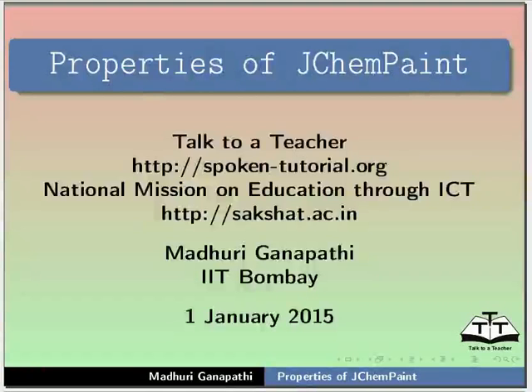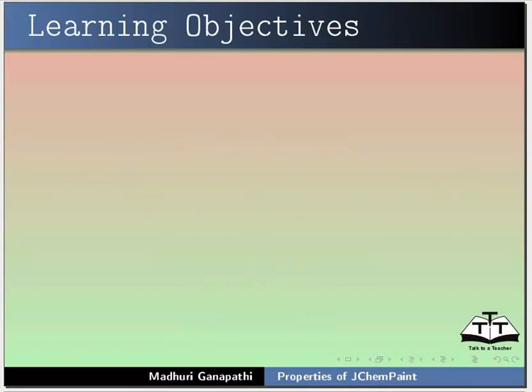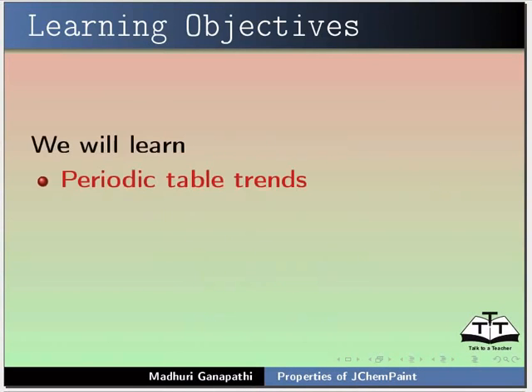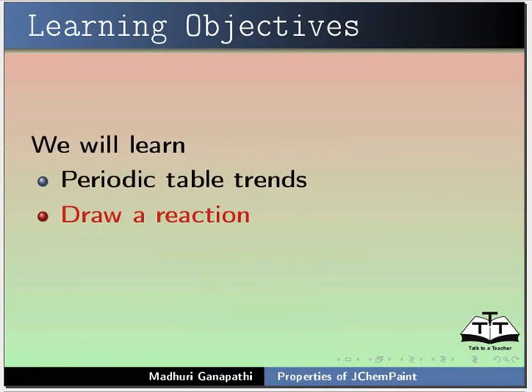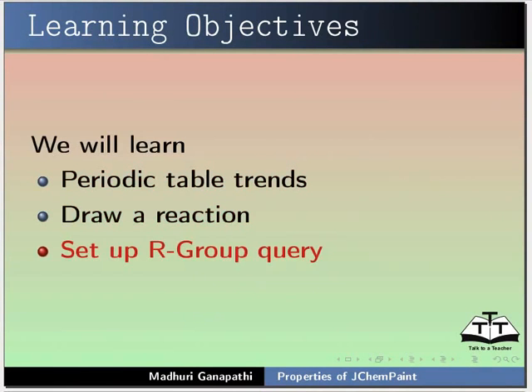Hello everyone, welcome to this tutorial on properties of jChemPaint. In this tutorial, we will learn periodic table trends, draw a reaction, and set up R-Group query.